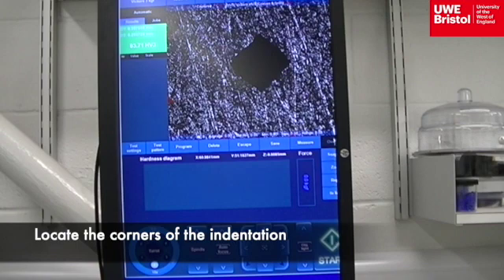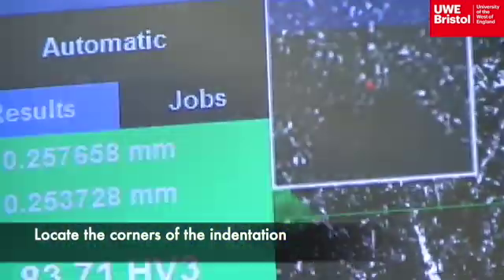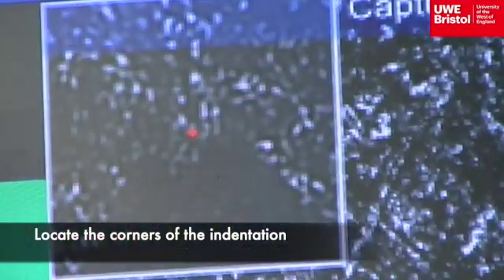The horizontal and vertical lines turn green when selected and have small red circles located on them. Each circle intersecting these lines needs to be located onto a corner of the diamond imprint. For a magnified view of the corners, in the top left hand part of the screen is a thumbnail image to assist locating the corners of the diamond shape.